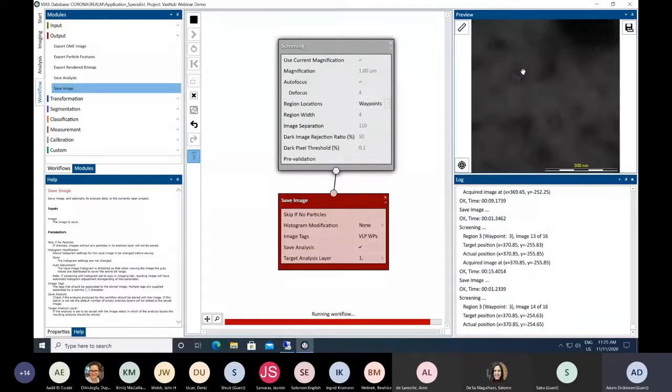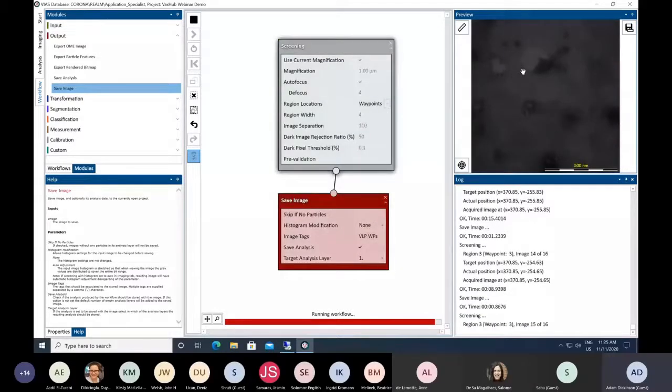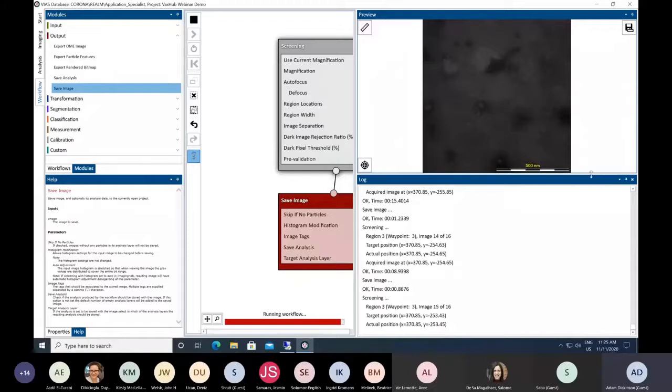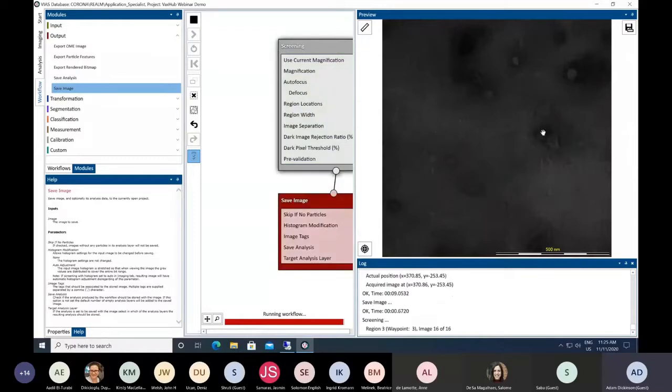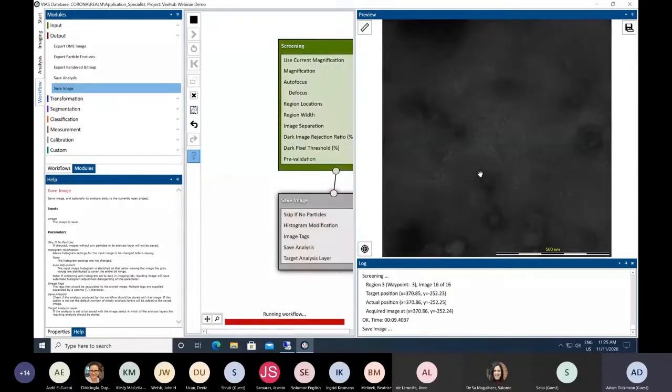These are a little bit dark, not to worry about these. I'm going to make that a little bit bigger for you so you can see what's happening there. Okay, that looks okay. On the images themselves, we can adjust the histogram to enhance the contrast and make these images look brighter, so they won't always look this dark.